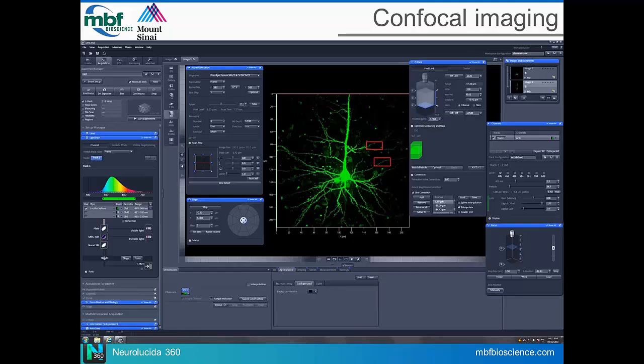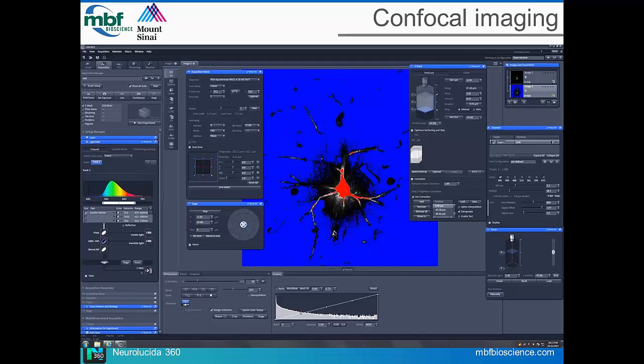And that's why that autocorrect from available on the brightness correction on the Zeiss is a nice system. And if you look at the next slide, we can see, again, adding this false color filter, we tried to crank down the gain as much as we could in that soma. I mean, it's the brightest part of the cell. It is very difficult. And so here, again, we're setting it at two different settings.